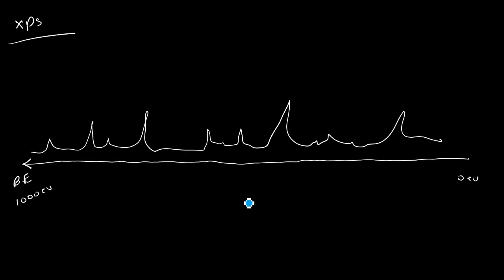Now like that we have several situations where we need some sort of advanced analysis. So we will identify each of them and talk about how to come up with the solution and how to analyze the particular scenarios. Now another data that we can get from this XPS is the concentration of a particular element on the sample surface. The concentration of an element is proportional to the peak intensity.